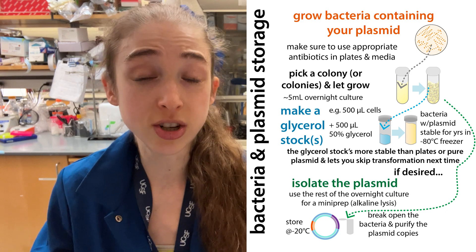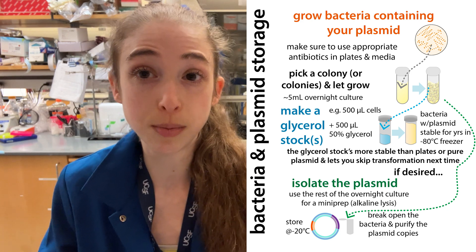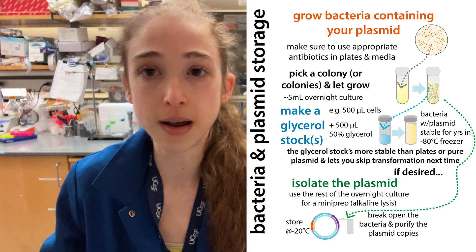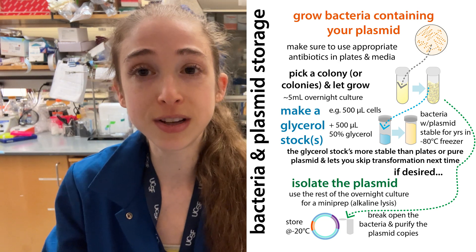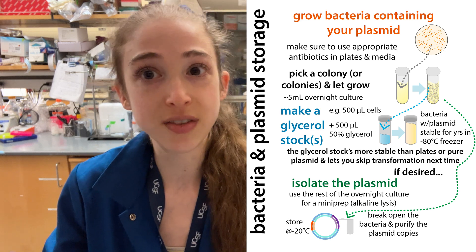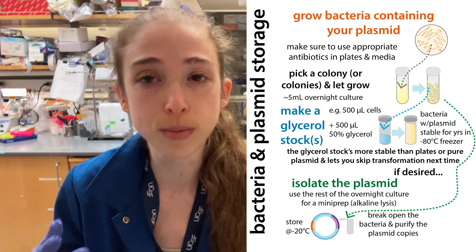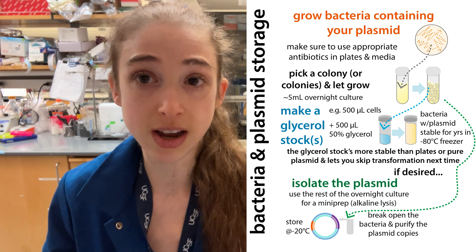Talking about long-term — these can actually last for years and years. It's going to be more stable than just storing your plasmid DNA in the freezer. Plus you have a source for making more without having to re-transform that plasmid into bacteria. You definitely don't want to run out of plasmid, then realize you don't have enough to transform into bacteria and have to redo all the cloning or order more. Having those glycerol stocks is going to save you time.